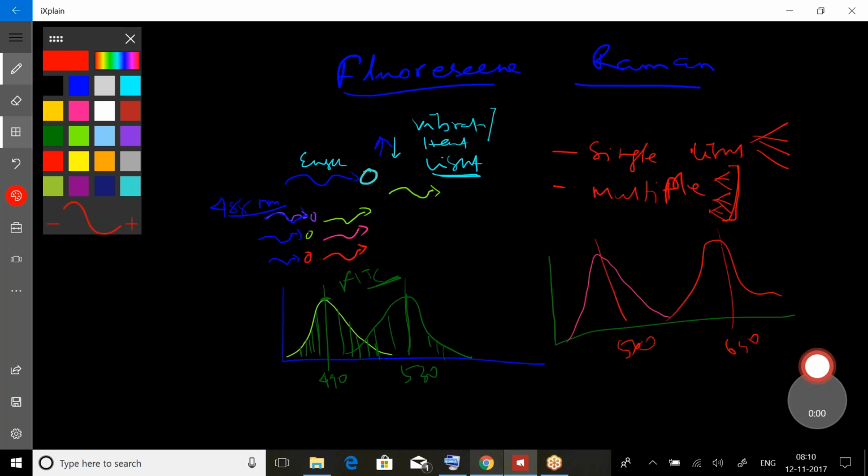We also use molecules that bind to a certain compartment of the cell, like DNA or RNA, and give fluorescence. They can even bind to something simple like calcium or different reactive oxygen species, and that gives fluorescence. So basically, we are collecting multiple different fluorescences.